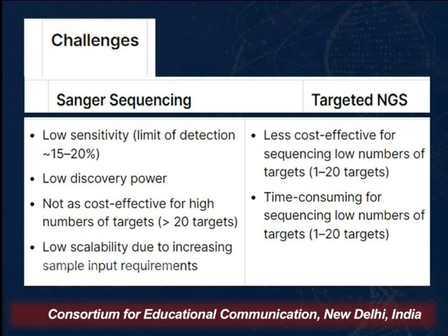And again, reproducibility, reusability. However, I should mention that Sanger sequencing is still used when you have got one or two samples. You just have to sequence a particular plasmid DNA, a particular insert in a plasmid DNA. Then Sanger sequencing comes very, very handy.